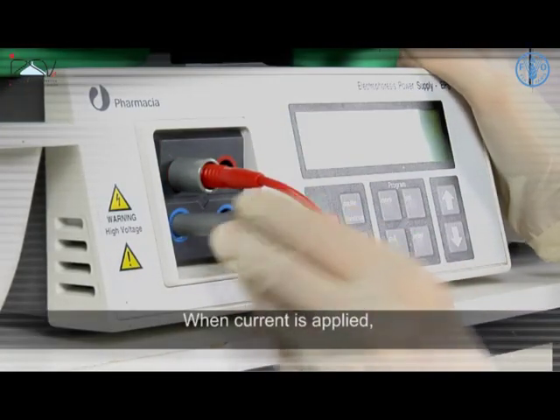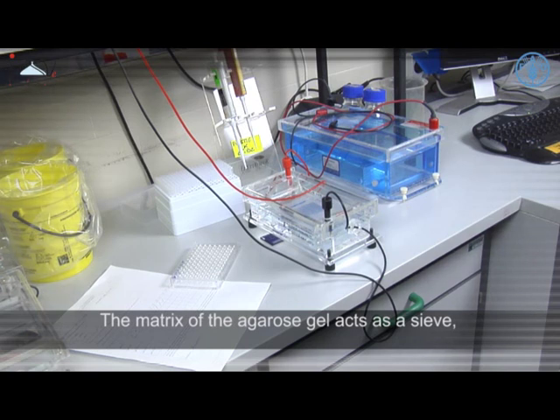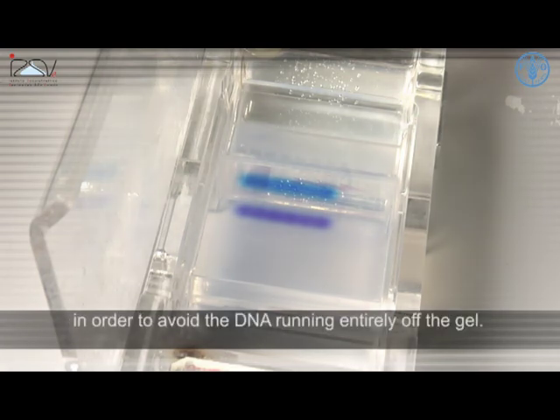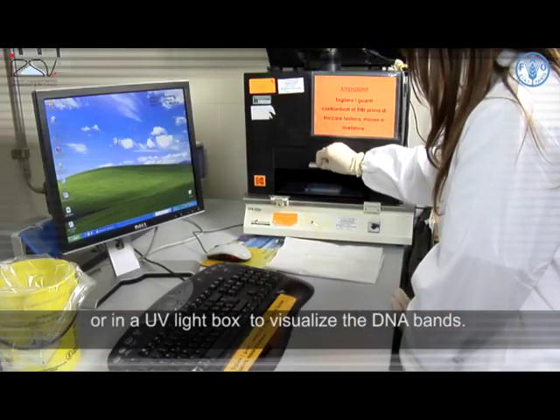When the current is applied, the negatively charged DNA migrates towards the positive electrode. The matrix of the agarose gel acts as a sieve, allowing smaller-sized fragments to migrate faster than larger ones, therefore separating fragments by size. Since the DNA is not visible during this process, the loading buffer helps the operator to control the run in order to avoid the DNA running entirely off the gel. When the run is finished, turn off the power supply and disassemble the gel chamber.